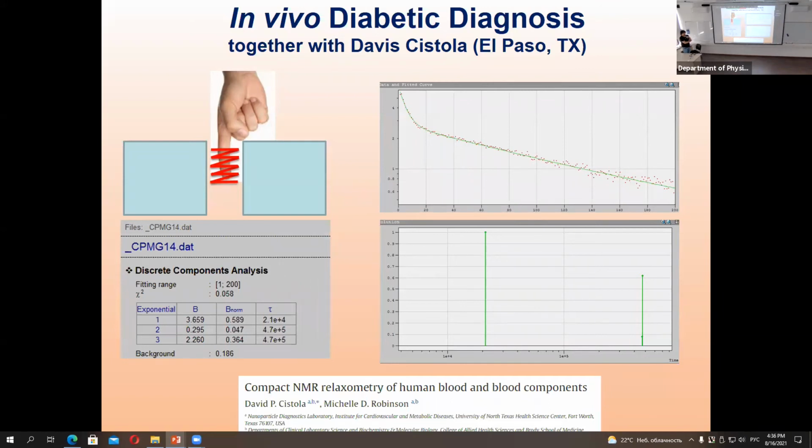You know, we are working here on hydrogen, so on H, and if something is changing with the mobility or molecular mobility, then you can see the difference in the relaxation times. We have lots of experience of measuring sugar in food. In principle, you can build the calibration, but only in a model system. This is not the case; you can't measure your sugar level precisely, unfortunately.